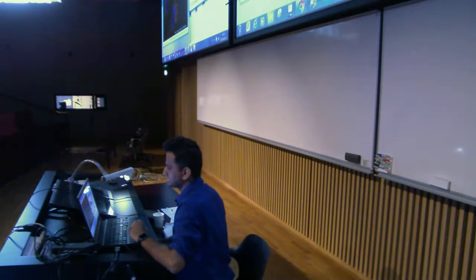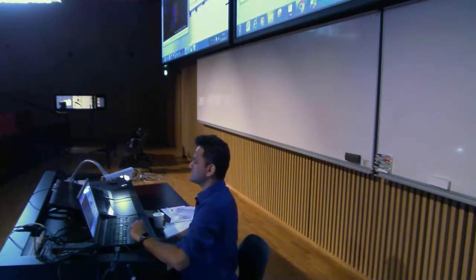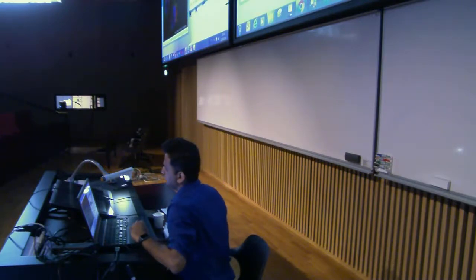And this clearly indicates that channel number 1, which is the red channel, has some pixels which are oversaturated. And why did I conclude this? Because there are some pixels over here. You see here in the histogram, at 4095, there are some pixels which have this intensity, and that could be this one, these pixels. Okay.